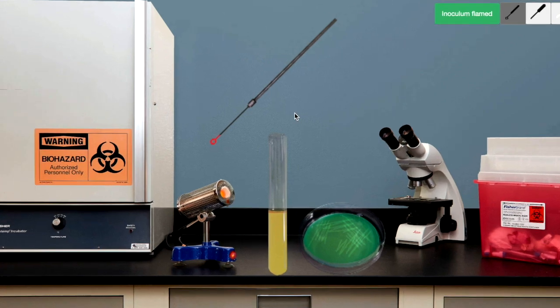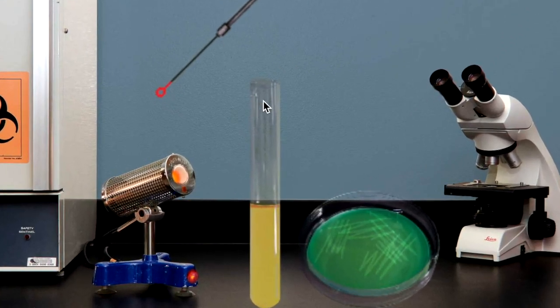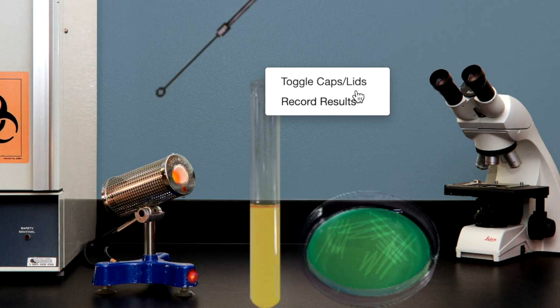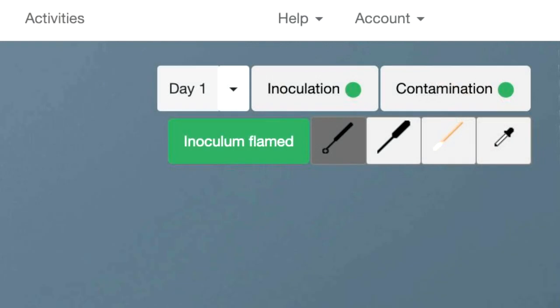Place the cursor over the mouth of the inoculum tube and click to bring up the option to toggle caps or lids, or double click. Do this to replace the tube cap and plate lid. Look at the traffic signals to ensure that you have two green lights indicating a successful tube to plate aseptic transfer.